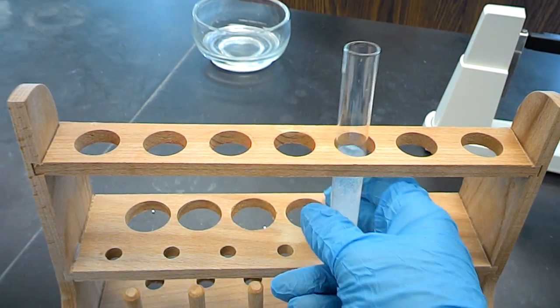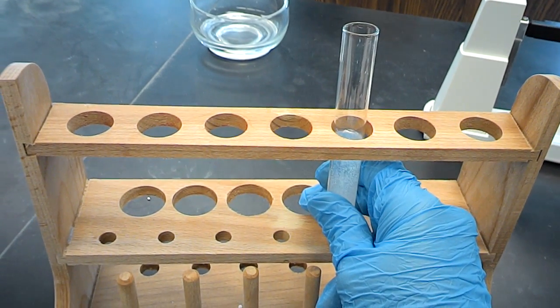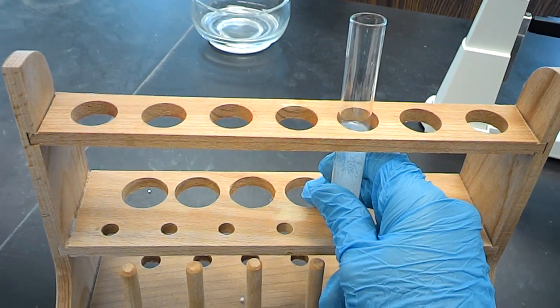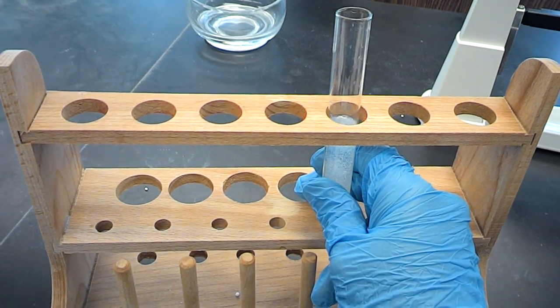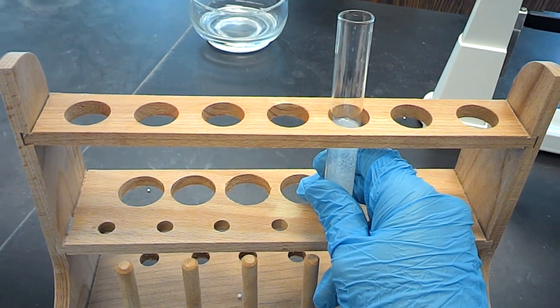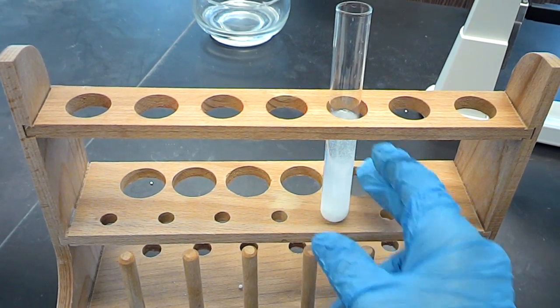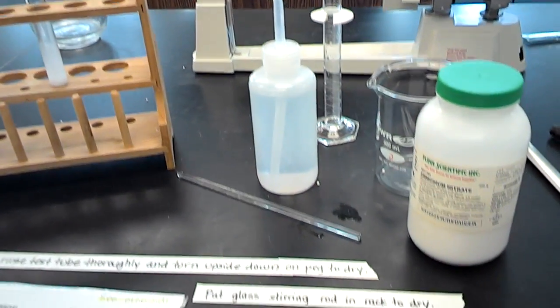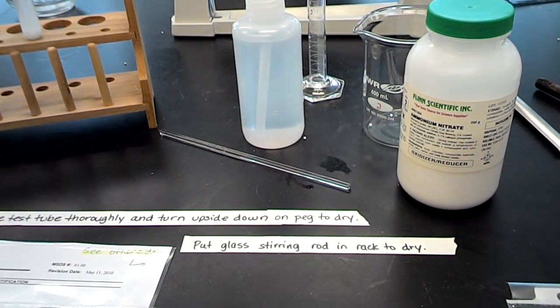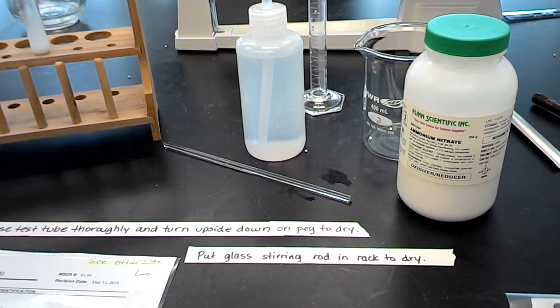Now when you touch the solution, I know you can't see it on video, but it becomes very cold. So you can determine if that's a chemical or physical change to go from room temperature to cold. This is actually the materials used in cold packs, like in your first aid kits.